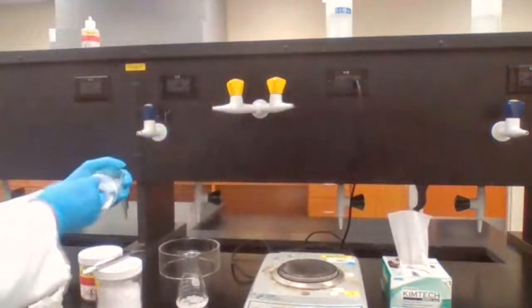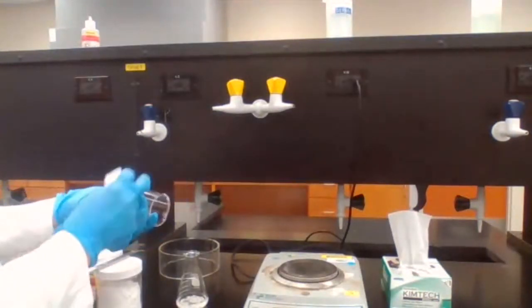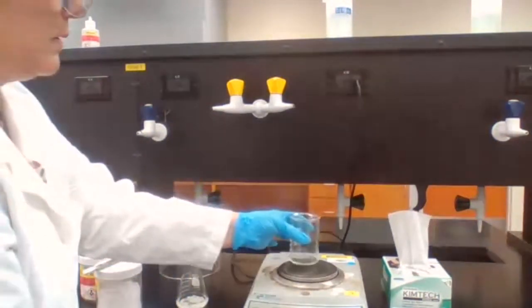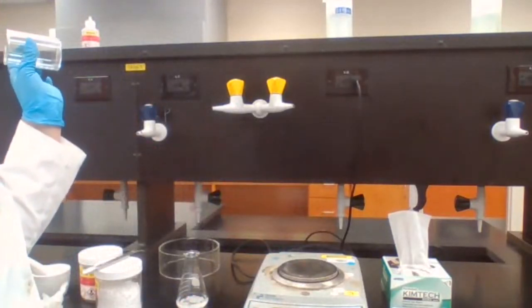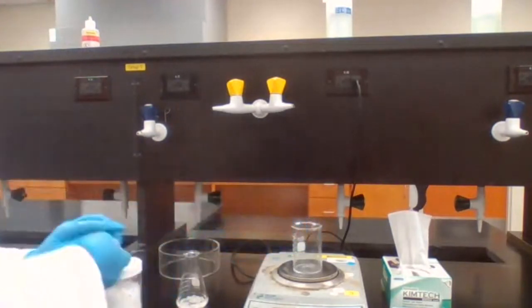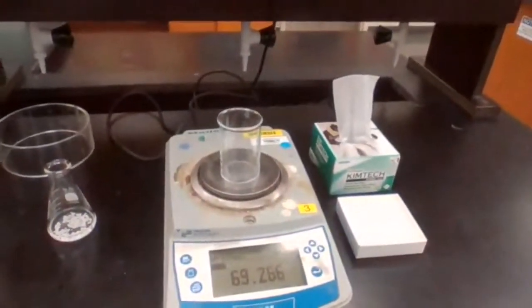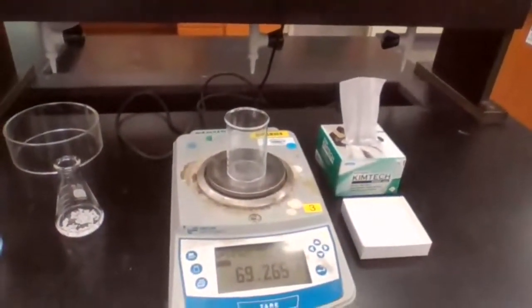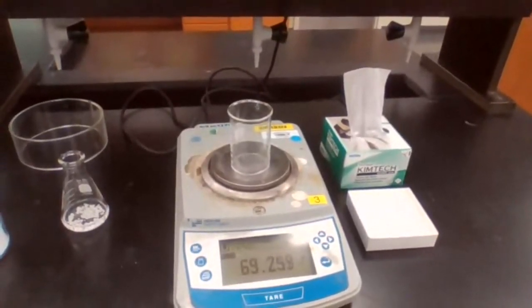I want you to record the mass of the empty, dry, clean beaker. Make sure there's no moisture. I get the mass. Sure it's here. And we have the mass of it. Can you record that number, please? You can take a screenshot or record the number.